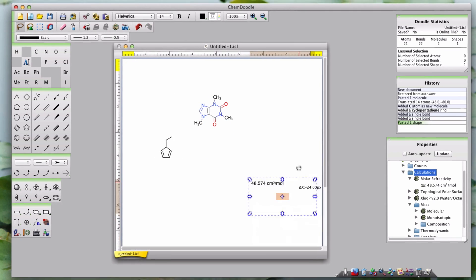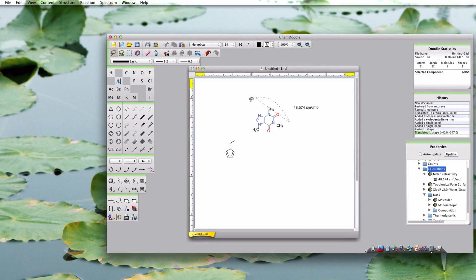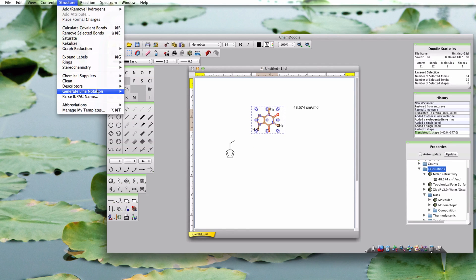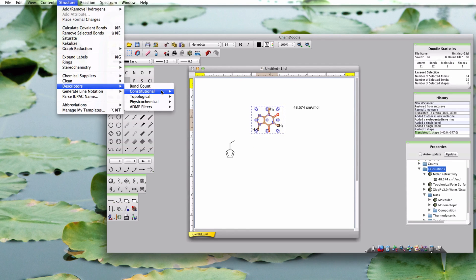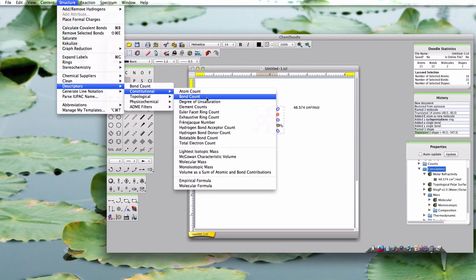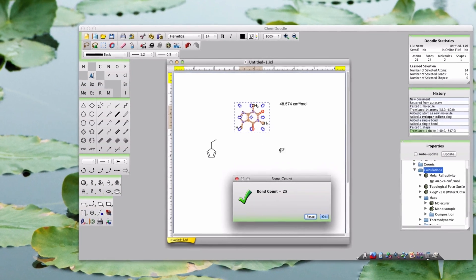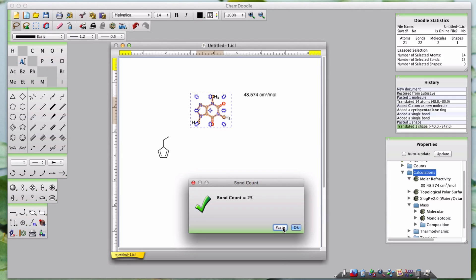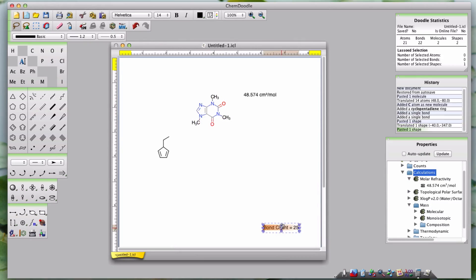In addition, you can access all molecular descriptor information through the Structure menu option under Descriptors. Just go to the descriptor you want — for instance, the bond count of this molecule. You can then click Paste if you want the information pasted to your document, or if you don't want it pasted, just click OK instead.